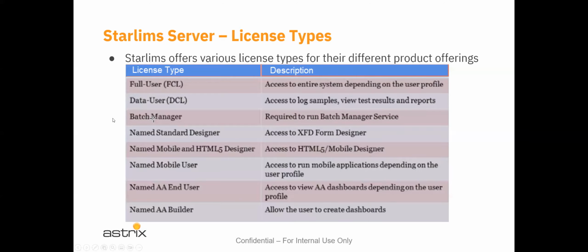A batch manager license is for one of these previously mentioned machines that process automated functions in the background that don't need to operate the system from the UI perspective, but need to have an established connection with the database so that the batch manager can operate and send instrument functionality or do additional workflow processing, not necessarily related to an instrument, but might take a sample, for example, and apply multiple tests to that sample automatically in the background, and then send that sample and partake it into analytes and different aliquots, that's small components of the sample, and fill up a 96 tray ELISA plate for whatever it might be.